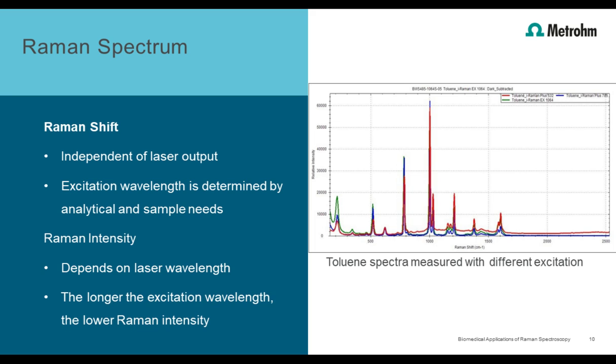A question that we get asked really often is, okay, what laser should I use for my experiment? That's really going to depend on the type of sample that you're looking at, as well as the analytical needs of the experiment.